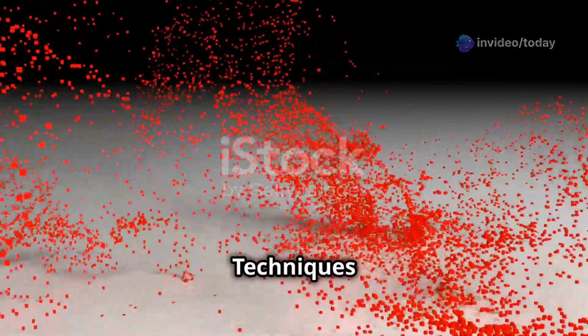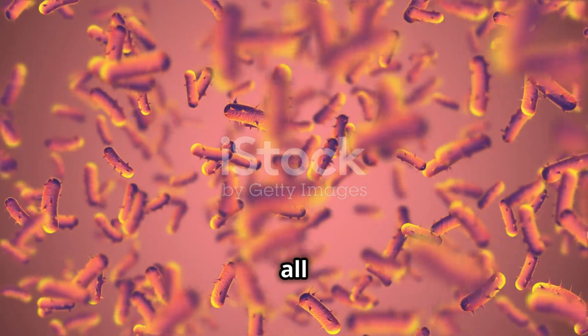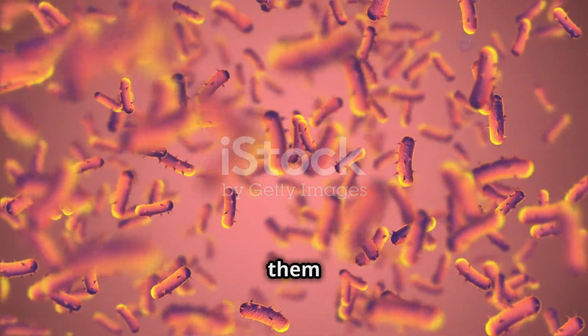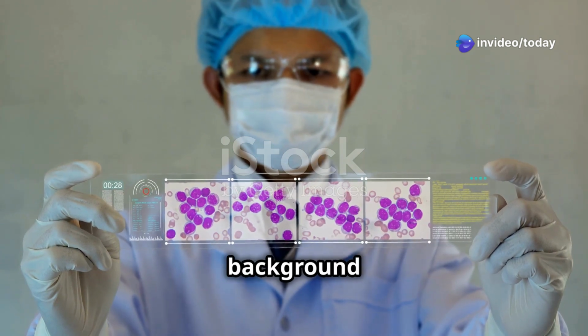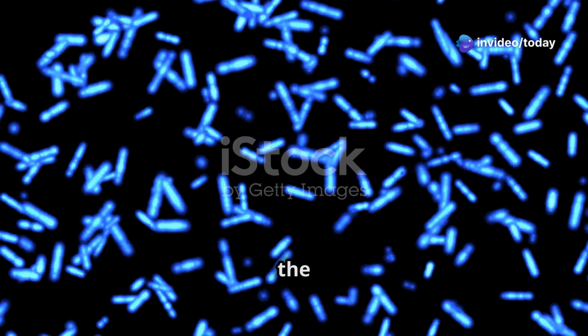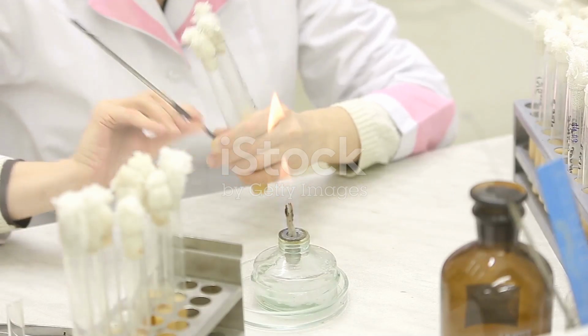Other staining techniques. Simple stain. This technique uses a single dye to stain all bacteria the same color, making them more visible. Negative stain. This technique stains the background around the bacteria, leaving the bacteria unstained and appearing as clear spaces.